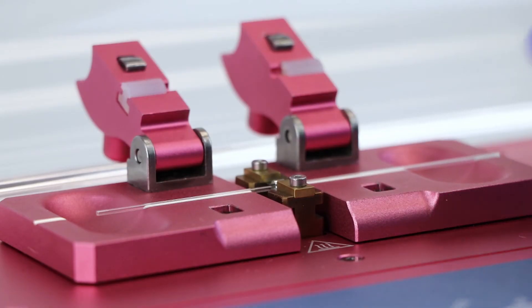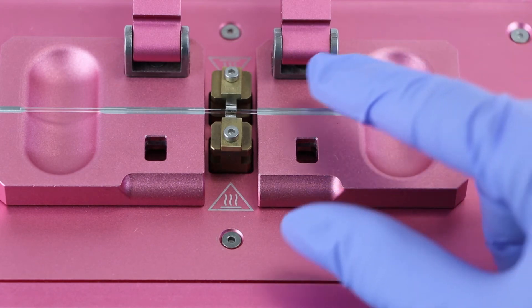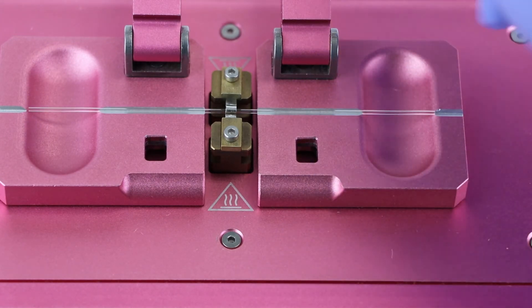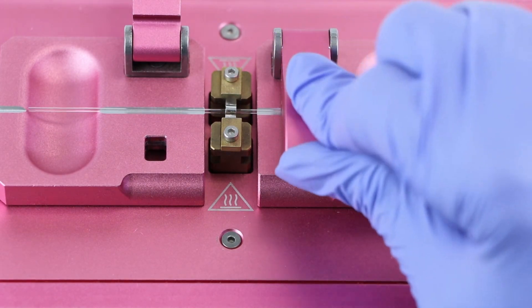Slide it through the center of the heating filament onto the other side. If you want two equivalent length micropipettes, be sure to center the glass in the filament. Secure the glass capillary with the clamps.